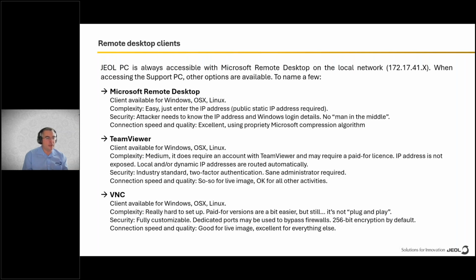The problem with TeamViewer is that it does require a paid-for license. It's not free. We as Jeol do have access to TeamViewer and we do have a commercial license for it. However, we are not allowed to share it with customers. We can use it for service and application support purposes, but we cannot give it to users. So in this case, the pricing is something that you would need to consider yourselves.